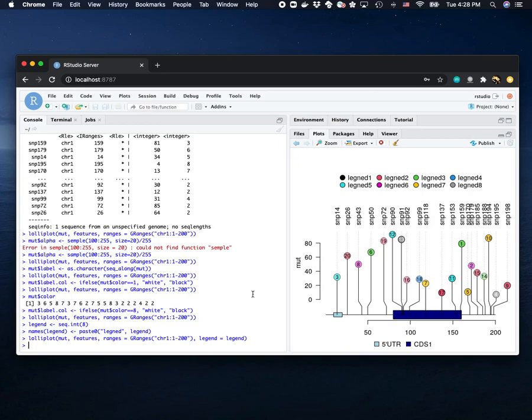If we want to change the plot into a pie chart, we need at least 2 scores. We set the score 2.